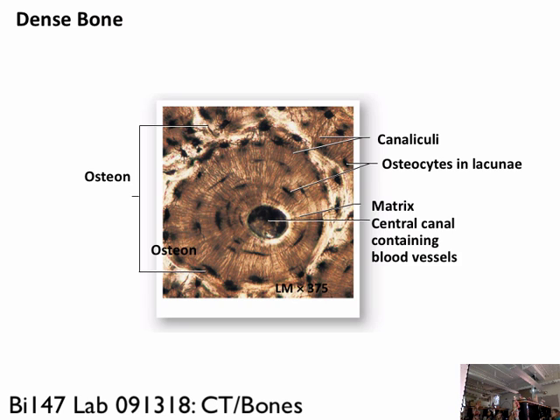An osteocyte is a bone cell. There are also osteoblasts. We'll talk about osteoblasts when I talk about bones in lecture, and how stimulating osteoblasts with yoga leads to healthy bones. But the osteocytes live in their own lacunae. There's a lacuna for each osteocyte, a little hollow space between these rings of dense matrix. And that's what these little black smears are right there. Those are the osteocytes in the lacuna.